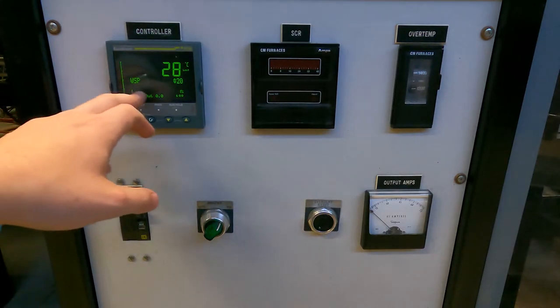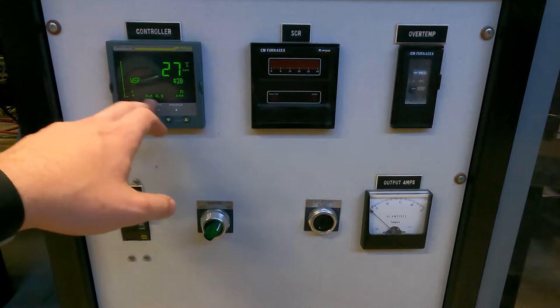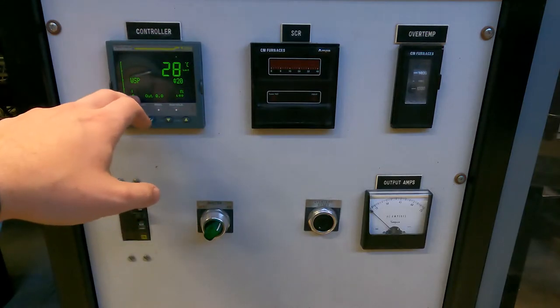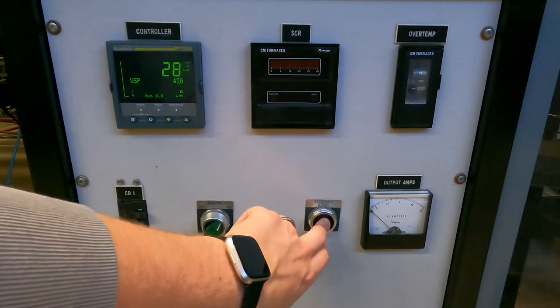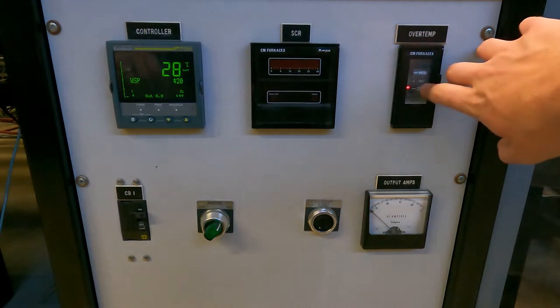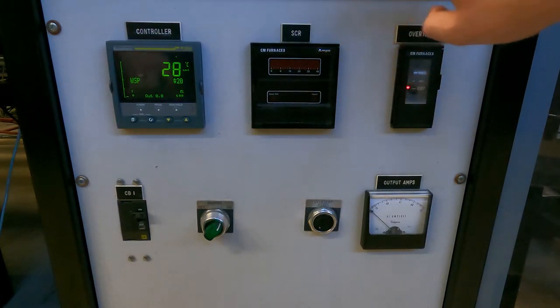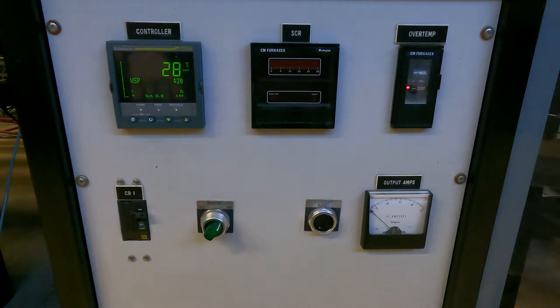We open up to this screen with WSP and the power out. Obviously the power out should be zero when it's not powering anything, so that's okay. The next thing you're going to do is hit the overtemp switch, and you hear the loud manual switch flip over, which is your manual reset. The light turned on up here indicating that the overtemp is active, and you also heard the fan kick on the furnace. So now you know there's power going to the furnace and everything should be ready to go.